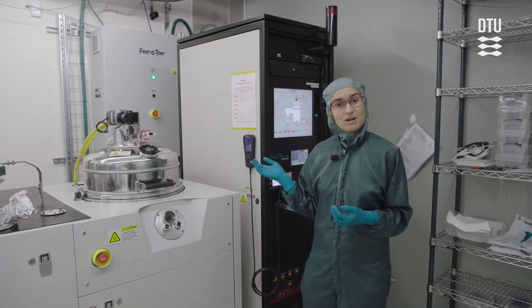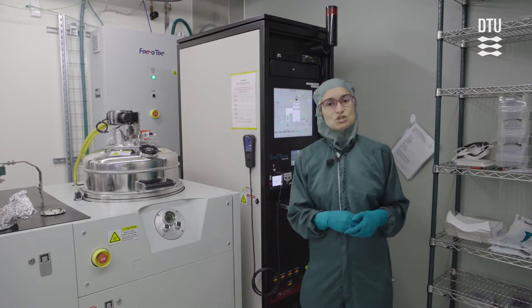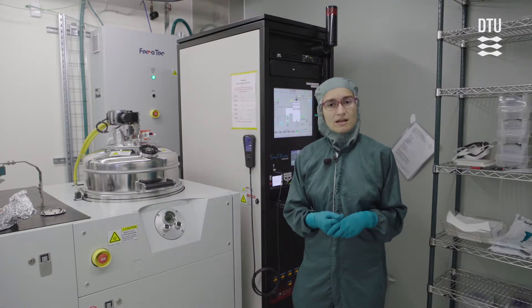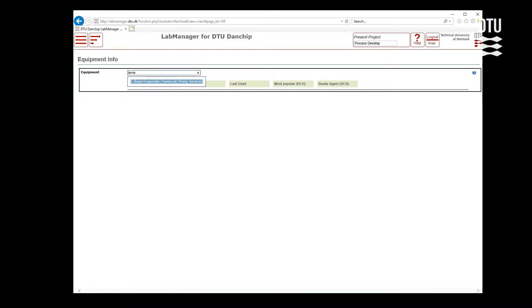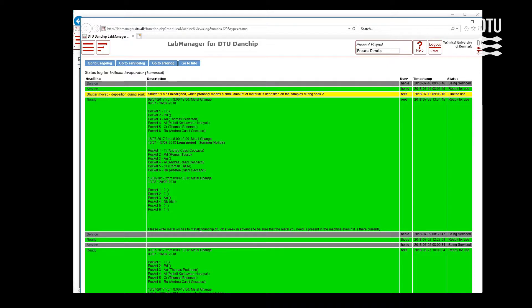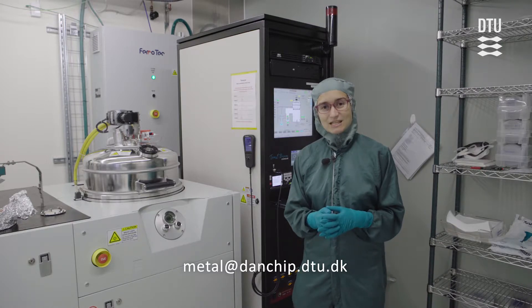There are six metals available at a time. You can see which ones are currently in the machine on the side of the machine, and you can also look in Lab Manager to see what's currently available. However, if you want to make sure that the metals you want are present when you need them, please send an email to us at metal@danchip.dtu.dk.